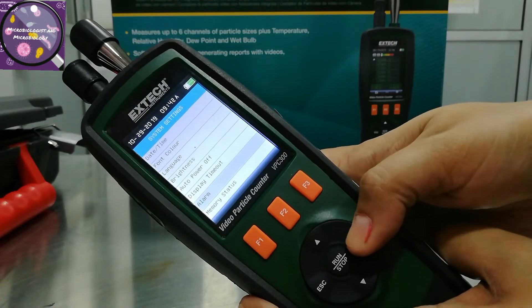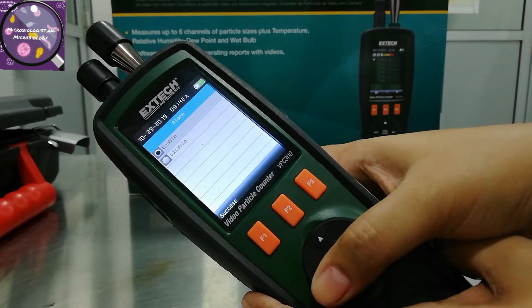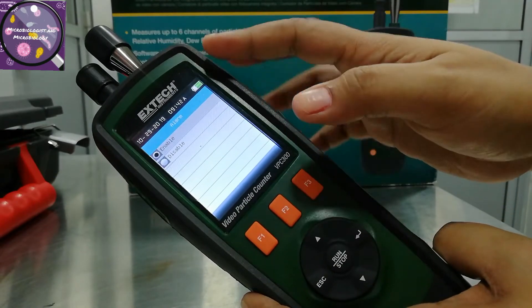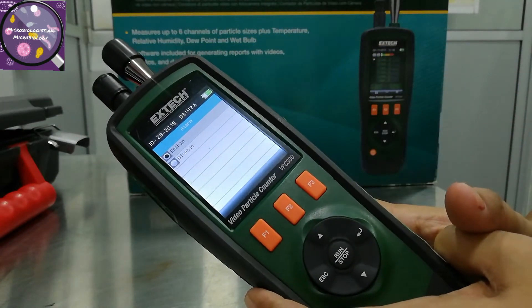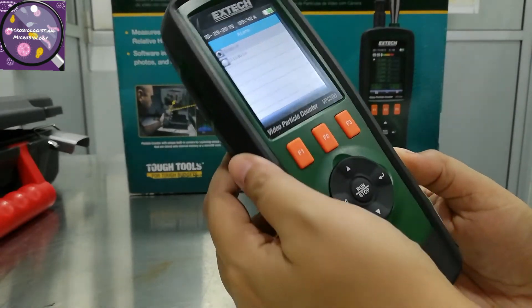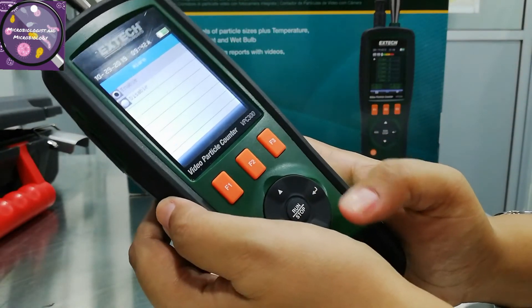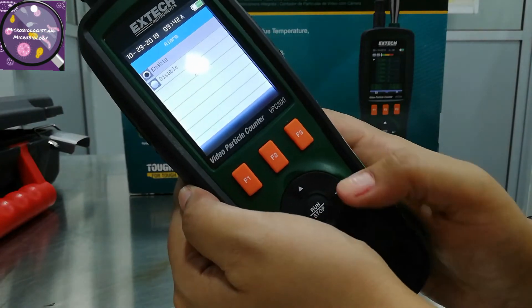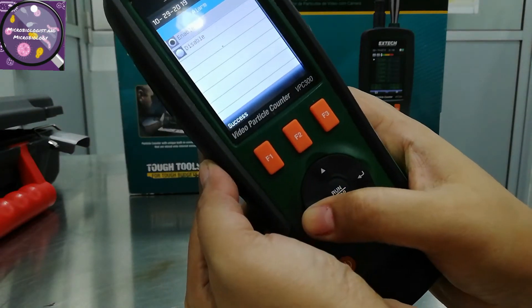The next option is the alarm — it is enabled. This means it will give a tone if anything happens, like if the result goes out of limit, then it gives an alarm.